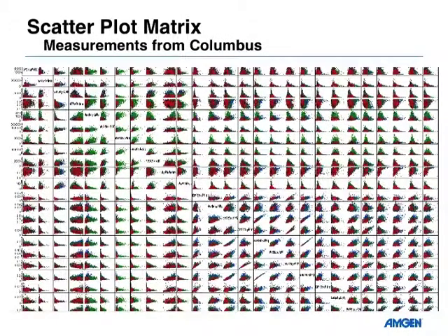One of the things I originally thought would be very nice is you could just do a scatter plot matrix and look at each variable, and maybe something will pop out. You would say, obviously it's these two variables that are important, and I could differentiate between my positive and negative controls. But if you picture a matrix that's 700 or 800 by 800 and try to figure out which ones are really important, it's not very easy.